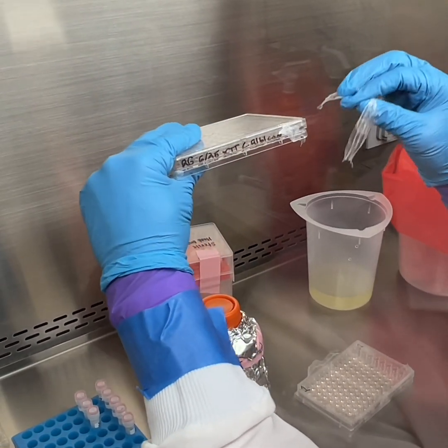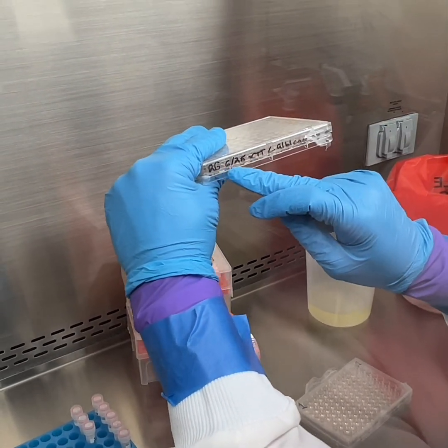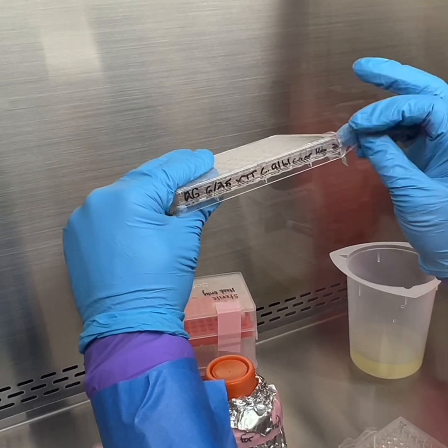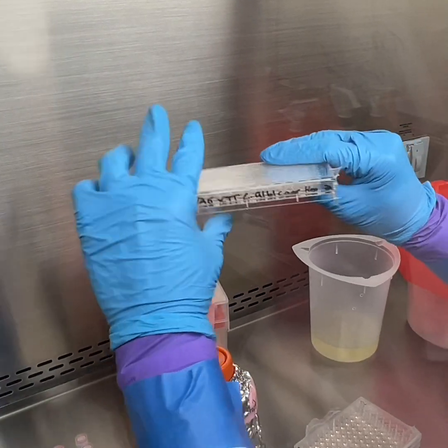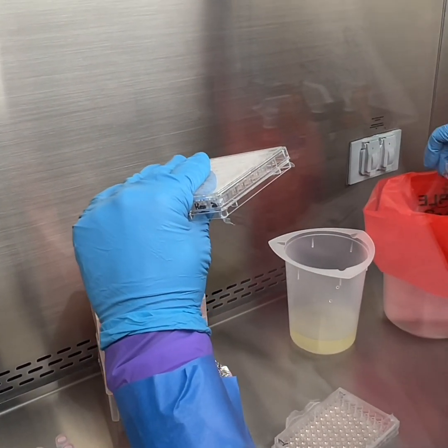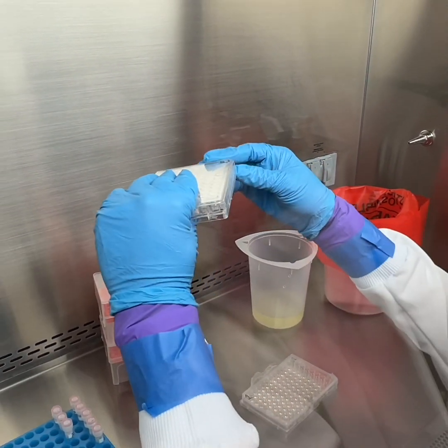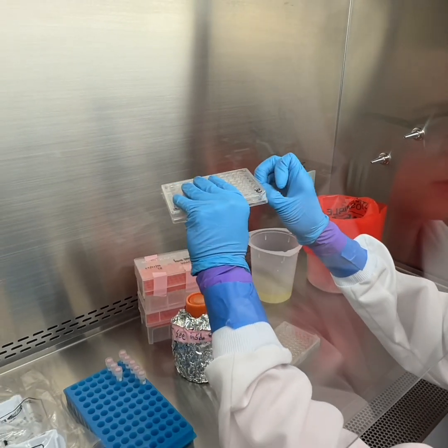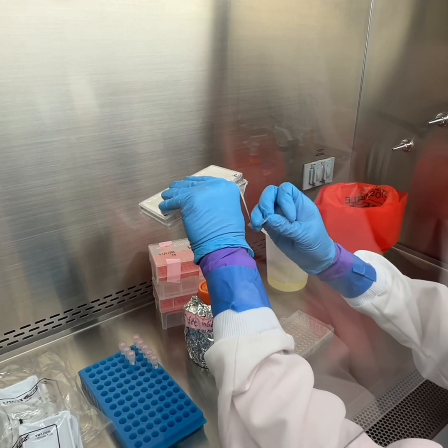But you'll see I have my plates labeled: name, initials, XTT, Candida albicans, and then heparin, and this is plate 2. Parafilm in the incubators almost melts, and so it gets sticky.